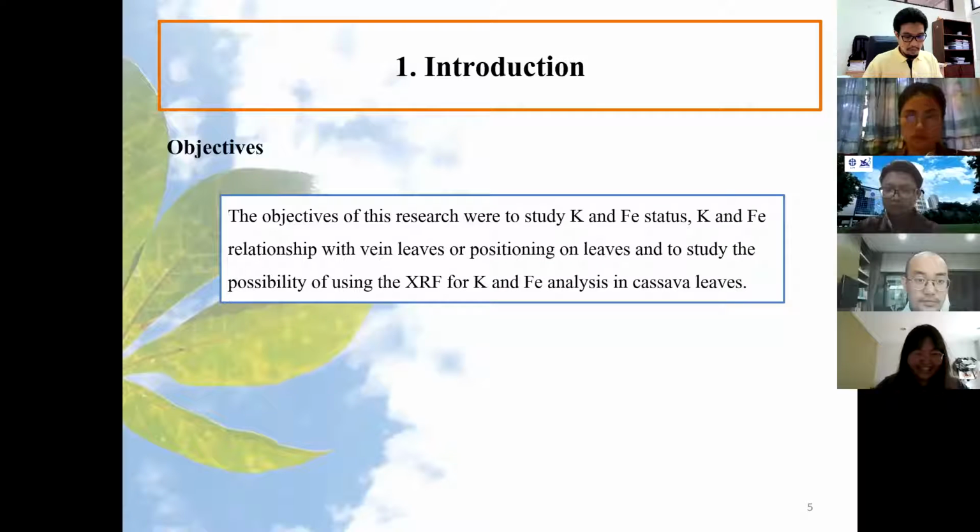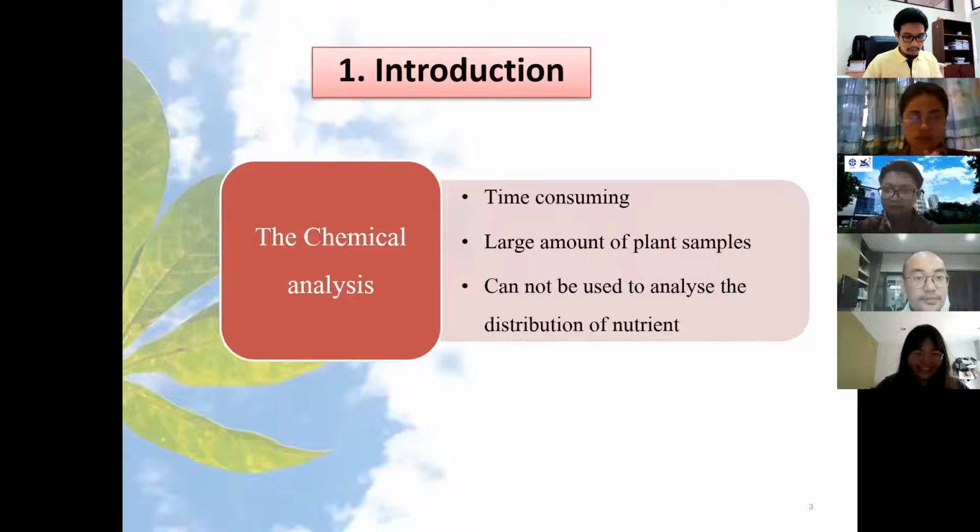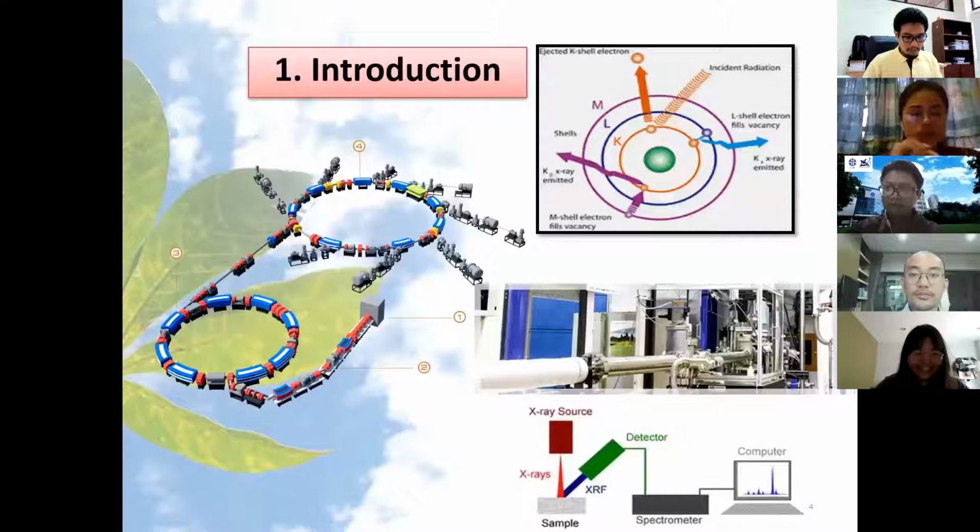Synchrotron light produced at the Siam Photon Laboratory is 1 million times brighter than the light from the sun, and can be used to study the atomic structure of various elements. It can provide suitable wavelength or energy for use in the research. In this study at the beamline 6, it is used to detect trace elements in materials such as plant and soil.